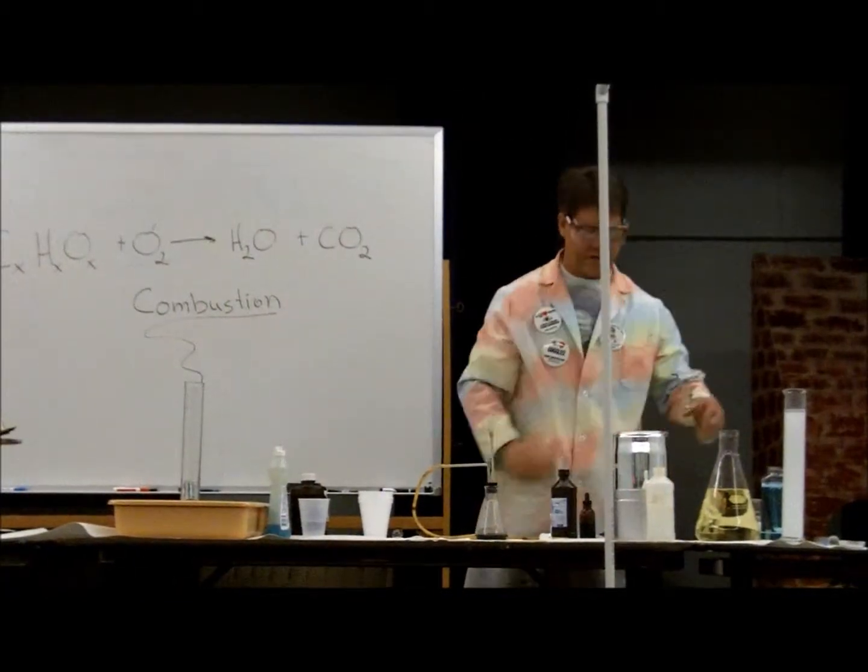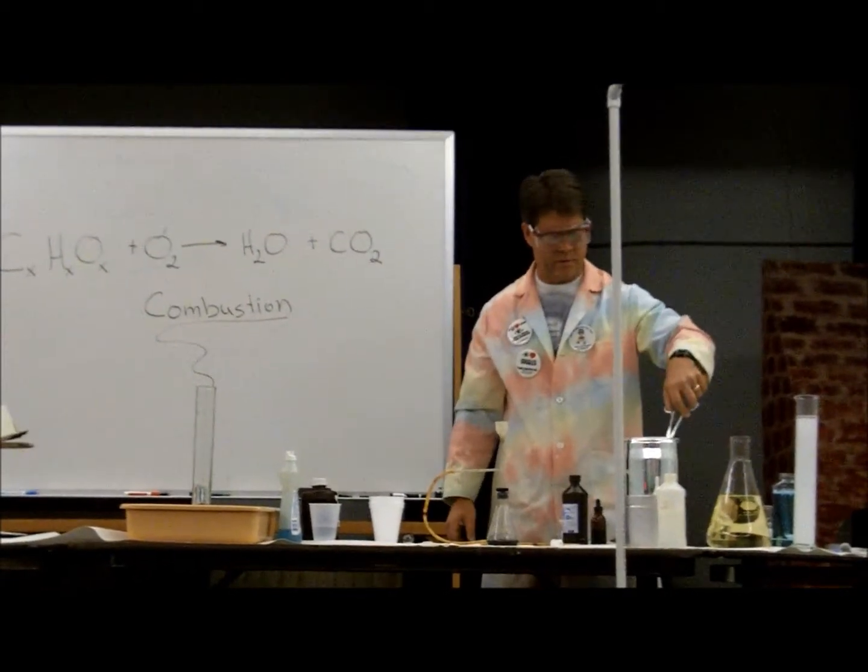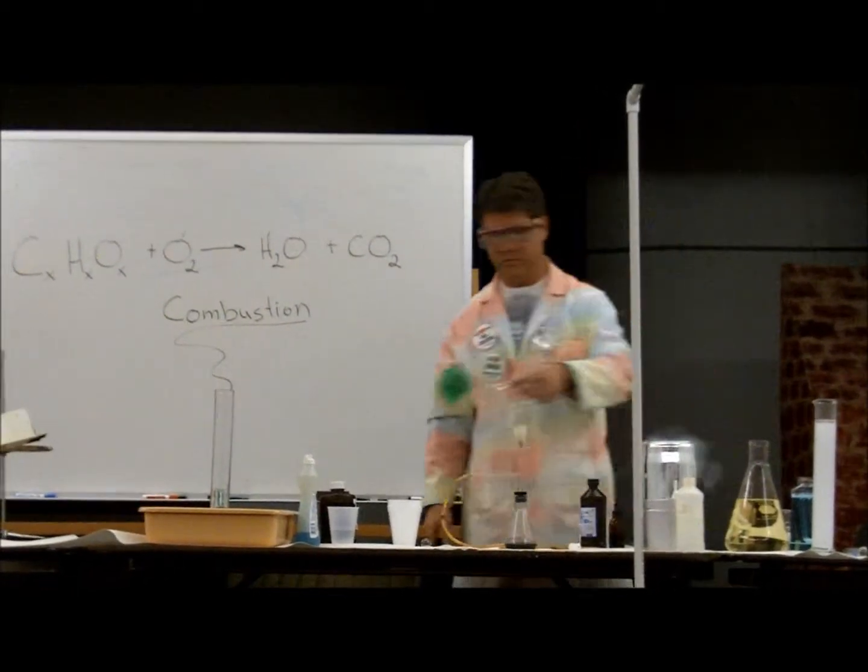Cold environment. And for that, I'm going to use liquid nitrogen. What have I got in here? I've got some squished balloons.